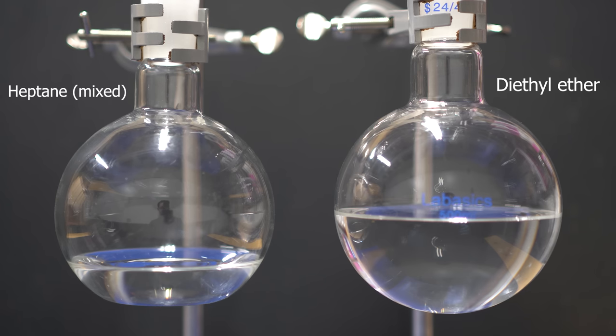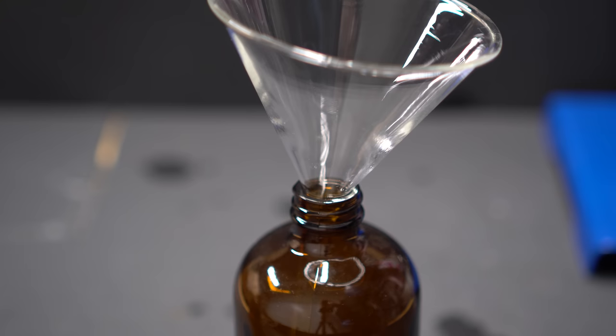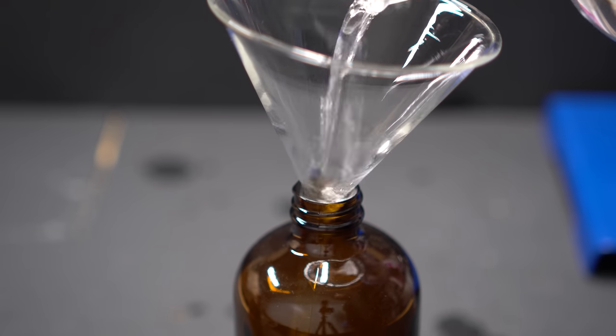From the two cans of the starting fluid you can see that we actually got a pretty good amount of heptane and diethyl ether. On the right is our diethyl ether and on the left is our heptane.